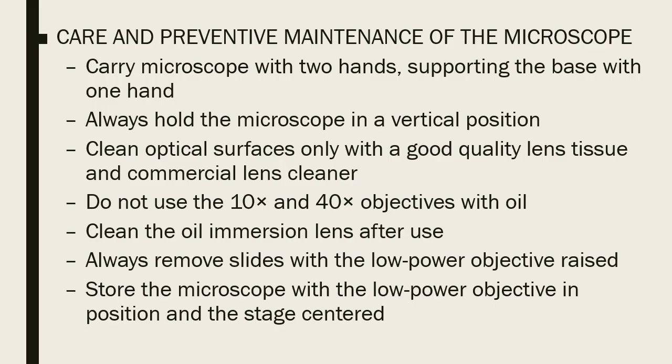Let's take a look at your care and preventive maintenance of the microscope. Of course, with this, you carry the microscope with two hands, supporting the base with one hand. Always hold the microscope in a vertical position, and clean optical surfaces only with a good quality lens tissue and commercial lens cleanser. Do not use solvents, and do not use the 10 times and 40 times objective with oil. The low power and high power objectives are for dry use only.